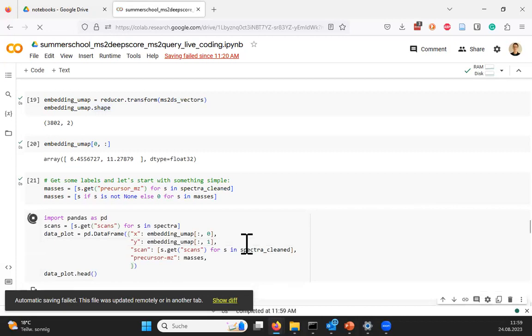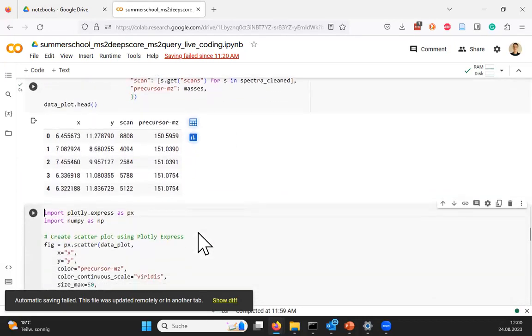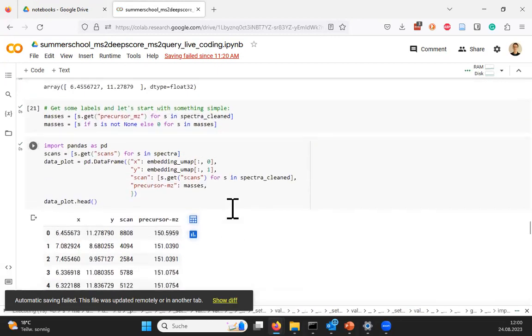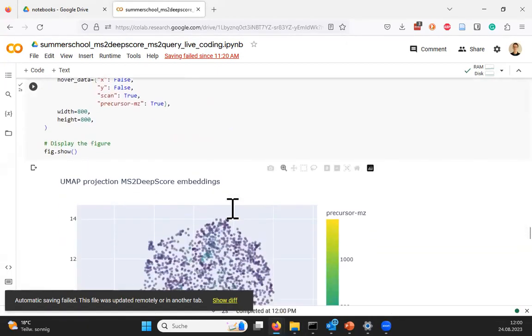You can skip this part, just believing that it's putting this into a table. And the nice thing about these notebooks is that you can plot things nicely. This uses a JavaScript-related library that works in Python and allows you to do interactive plots. The complicated part is the computation, while the simple part in Python is usually the plots.